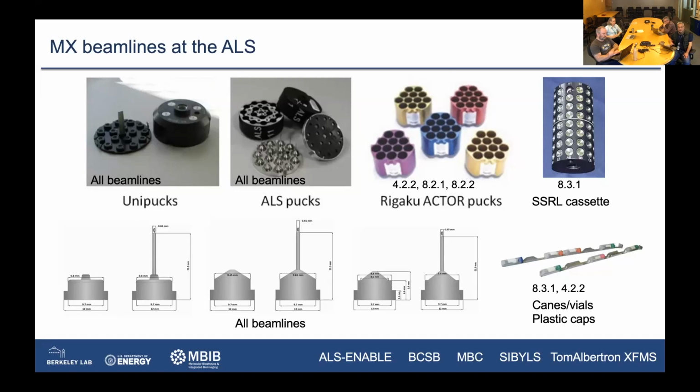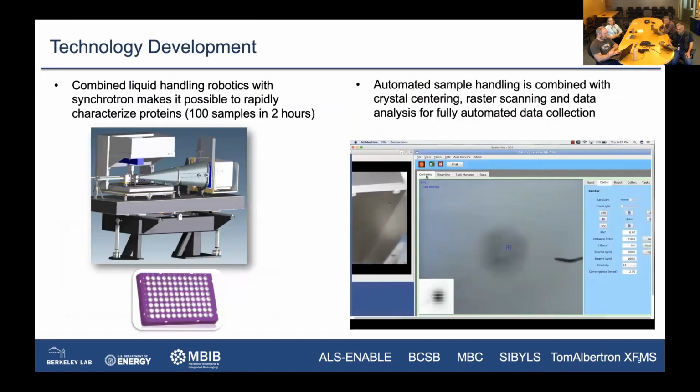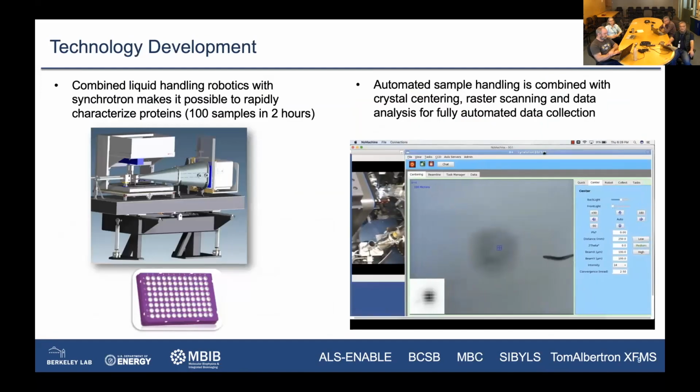I will say this, spine pins cause the most problems for the different robots because it is a slightly different size. And the ones with the shoulders can cause problems. Well, I know in Sector 8 and Sector 4, we've had problems. And so, yeah, that's a general overview of what we'll be talking about today.